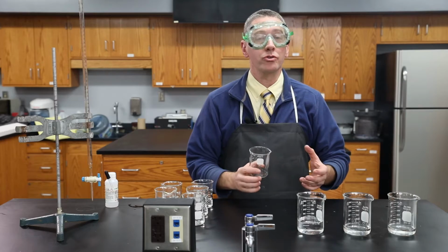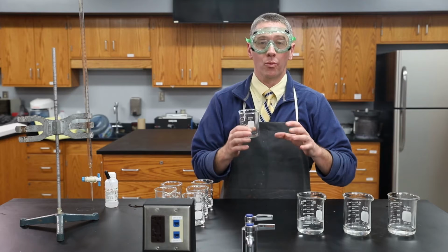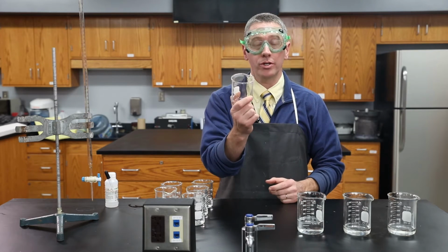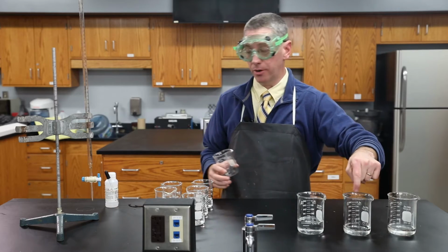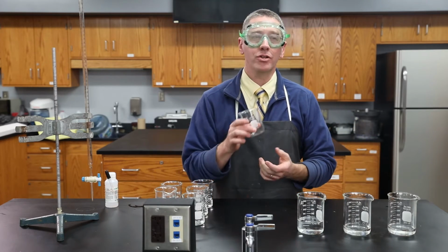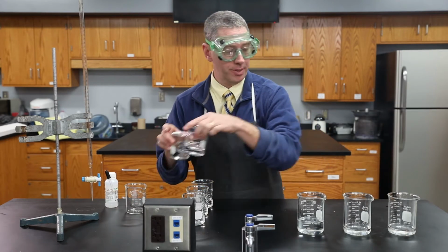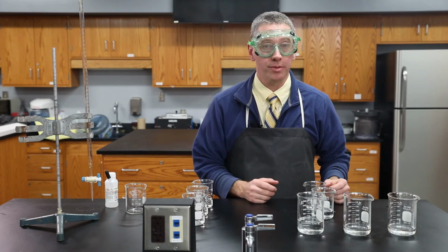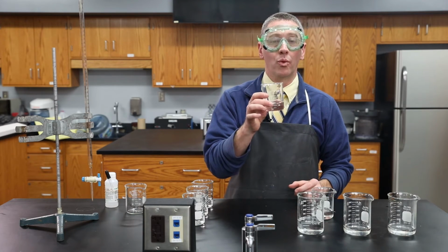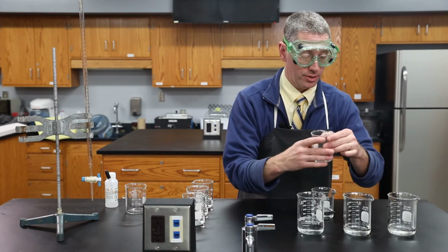So we were able to neutralize 1 molarity base with 1 molarity acid because you had 1 unit of OH and 1 unit of H+, and they neutralized each other. But now if it's 2 molarity base, you're not going to be able to do it with 1 amount of acid. It's going to take twice as much. That's because if this is 2 molarity, it has 2 OH minus groups, and this only has 1 amount worth. So we're going to need 2 beakers to make this one neutralize.